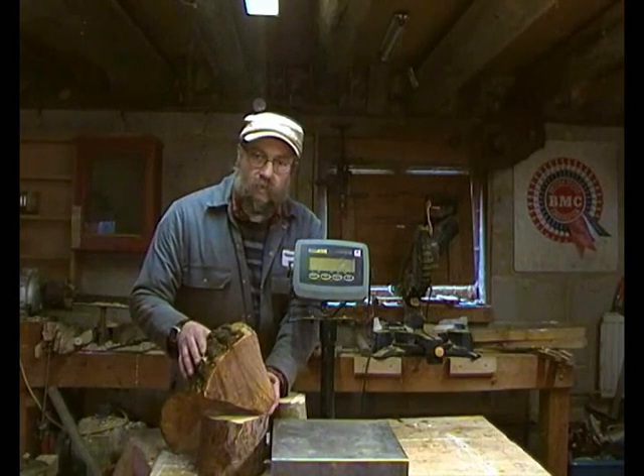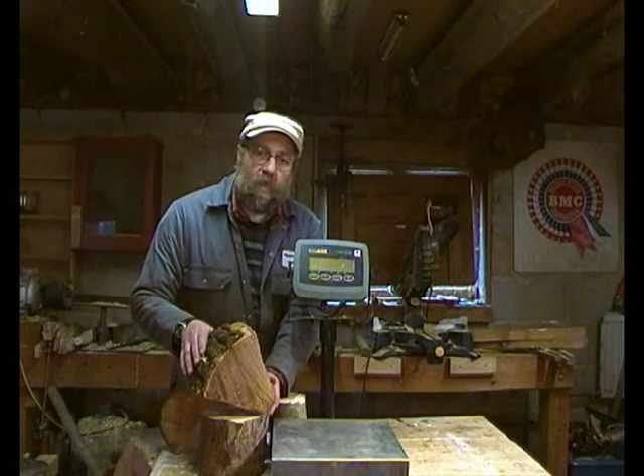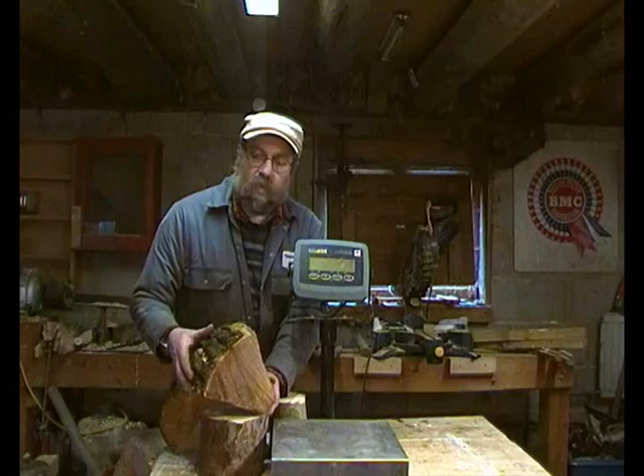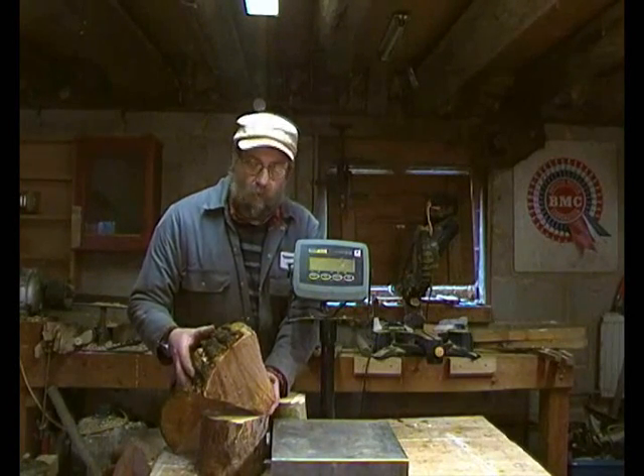What I'm going to do is split slivers off each piece and then weigh them, but I'll split them off camera because everything will bounce about and there'll be loads of noise.